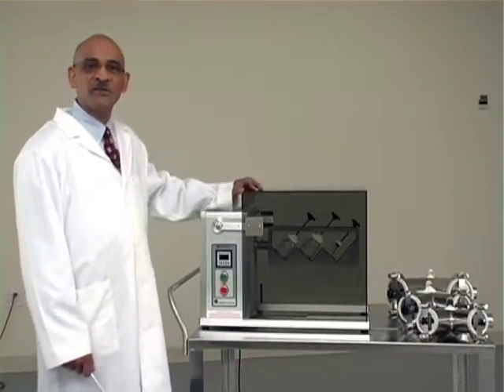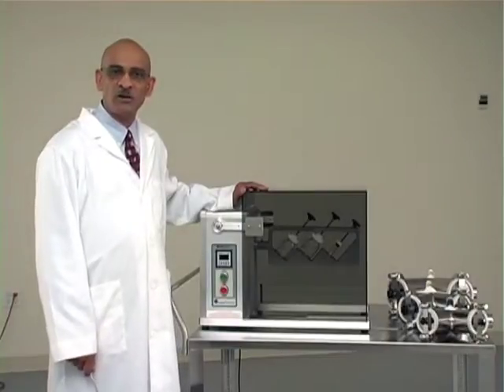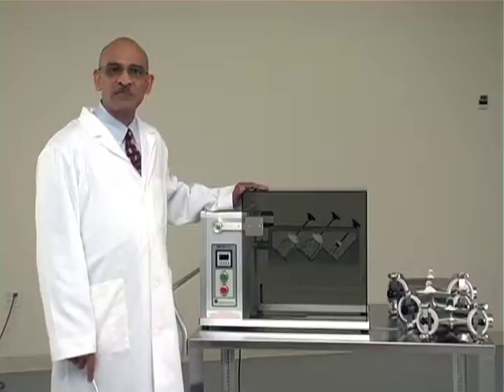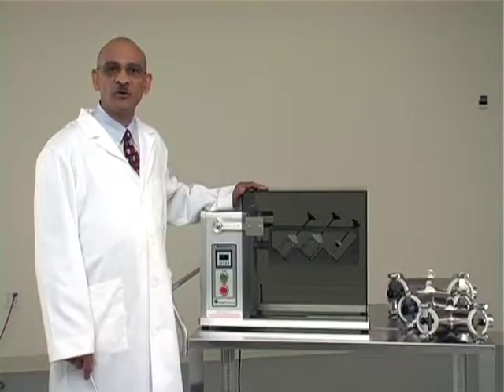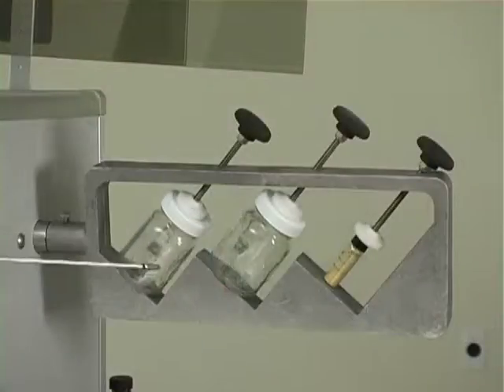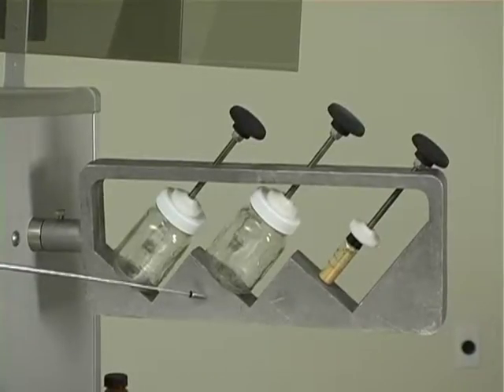This machine was designed to blend powders in small quantities. You can blend as small as 5 grams or even 2 grams of the material, or you can go up to 1 kilogram using V-shells. This blender accommodates a bottle blending attachment which is already installed on this machine.